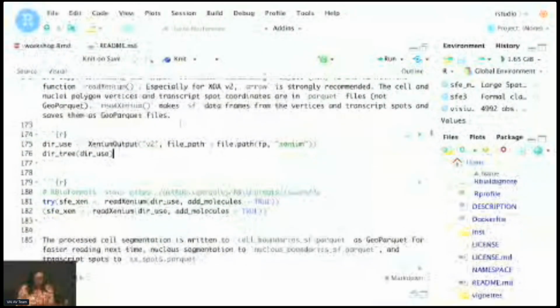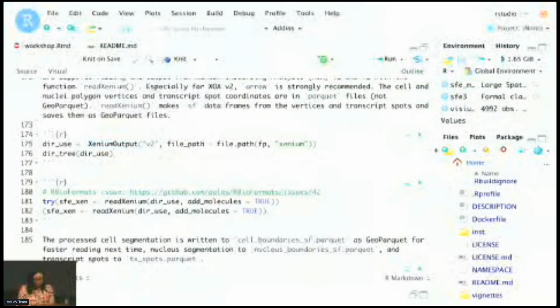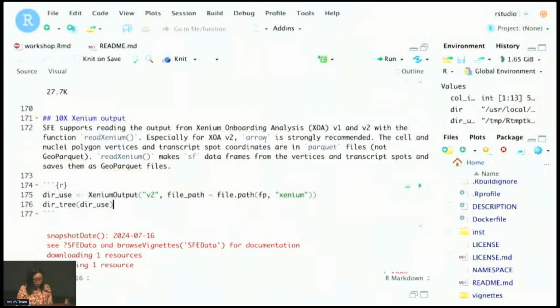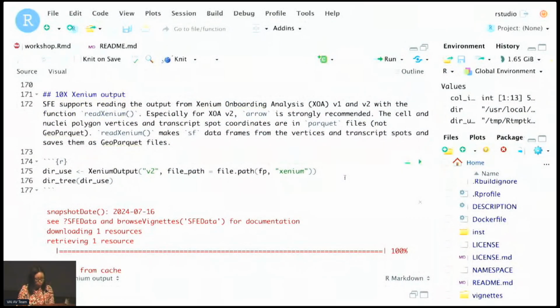All right, so next, 10x Xenium is another one of the popular, getting more popular commercial imaging-based technologies. Again, there is a subset of a real data set from the 10x website provided by the SFEData package. For Xenium, the pre-processing software, the Xenium Onboarding Analysis, already has 2 versions in release.